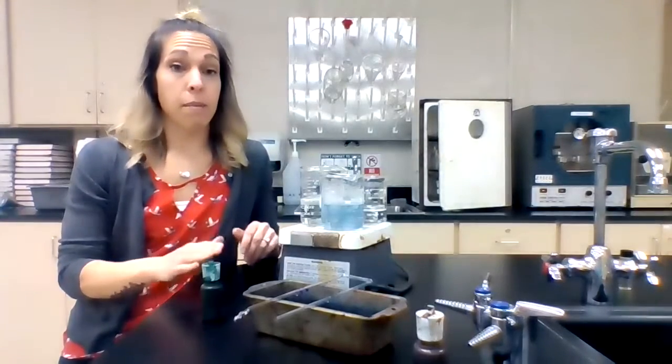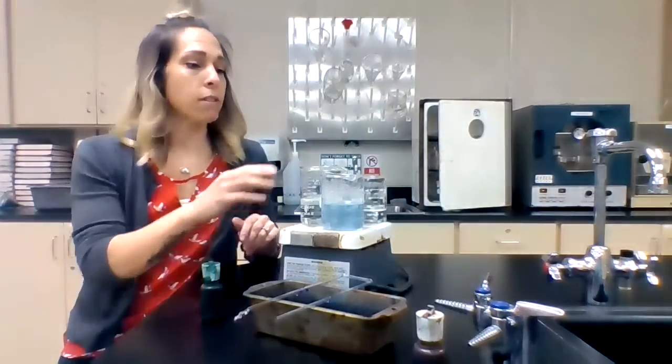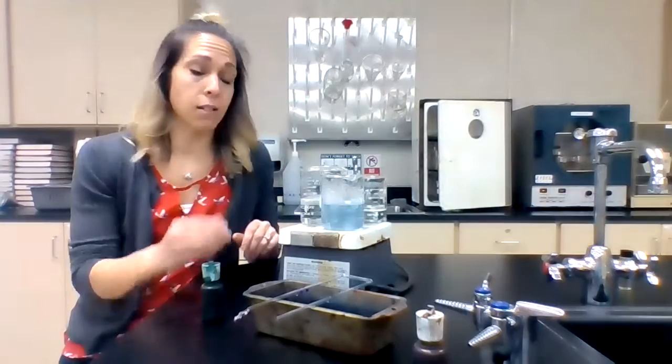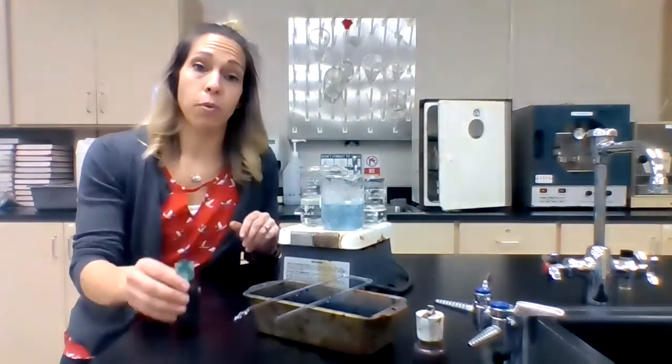You're going to sit here and babysit this for 5 minutes. So we're going to be really careful not to burn ourselves, but every time it looks like it's starting to dry up, you're going to put a couple more drops of the malachite green on it. So I'm going to sit here, watch it. I have my paper towel. I'm going to occasionally drop more on it.